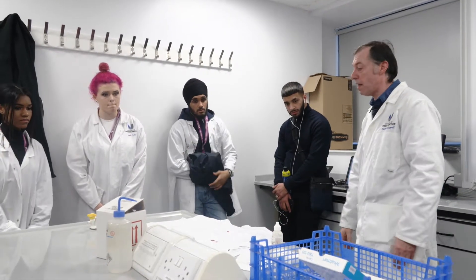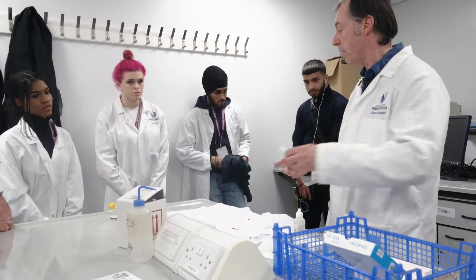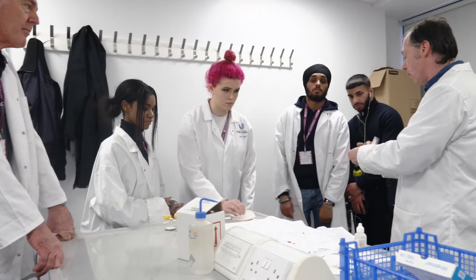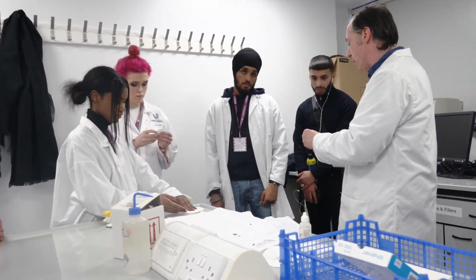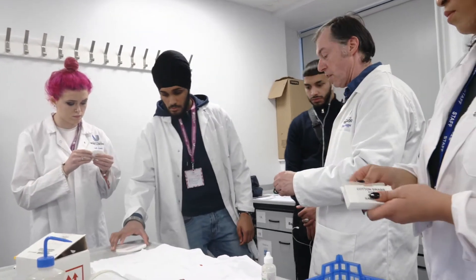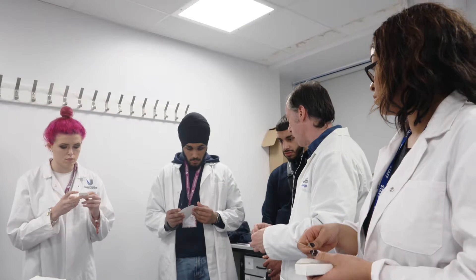So you can all have a go — there are other stains here you can try. You've got plenty of filter papers. Take a corner, scrape the stain with the edge, open it out, then add the solutions to it. If you see a pink or red colouration at the end, that indicates that it is blood.